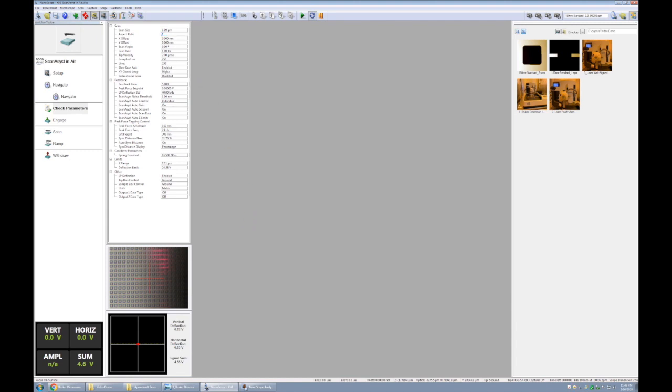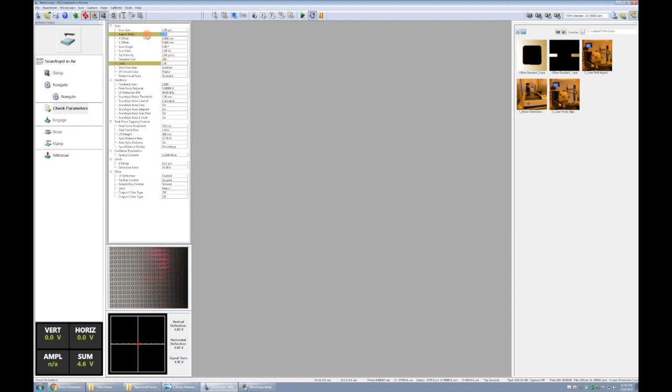If we were to change this to two, then we'd still have one micron x, and we'd have a half micron y. So the aspect ratio is the ratio of x to y. Note that any parameter that gets changed from the defaults that loaded with the experiment will show up as green. It's not a problem, it just means that it's been changed.